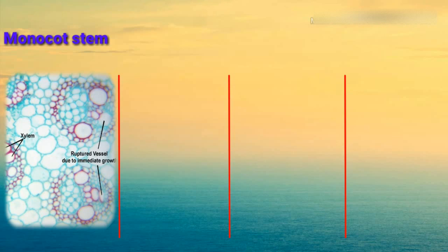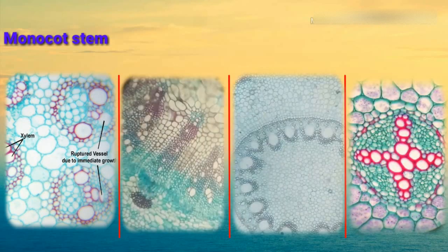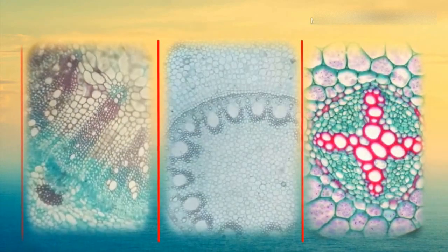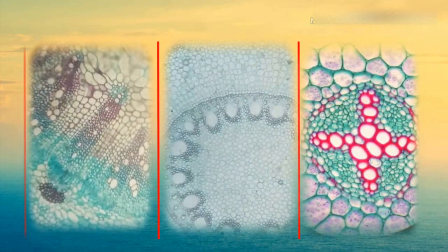So here we have three remaining slides — we have to distinguish monocot root, dicot root, and dicot stem among them. Most probably you can easily find a dicot root among them. Can you identify the dicot root among these three slides? I'm going to give you some time — try it by yourself.